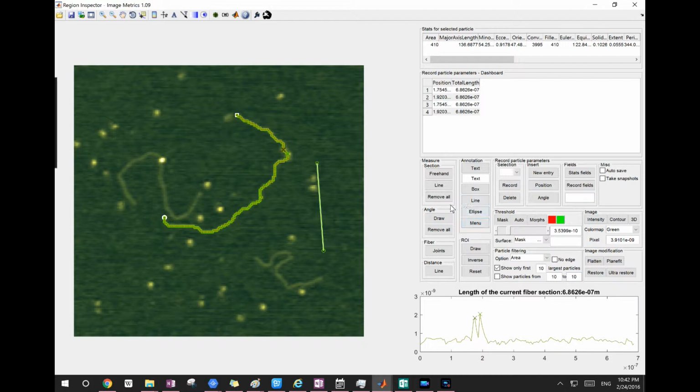And if you don't want that, so this is a table. This is a core dashboard. It basically records all your parameters. They will show up here, and you can play with the table. Maybe I should discuss that in another tutorial. So I'm not going to discuss how to work with the table.